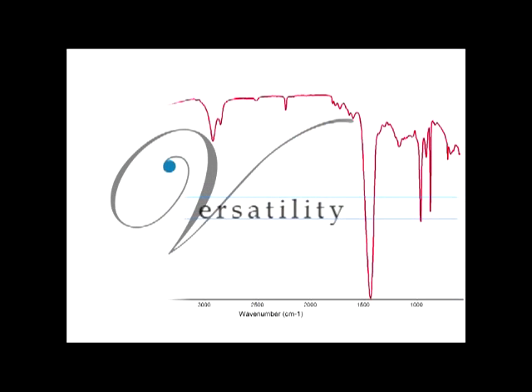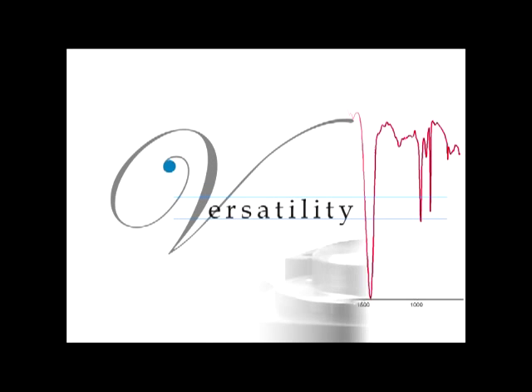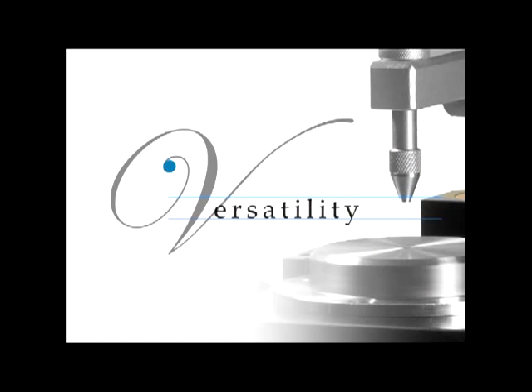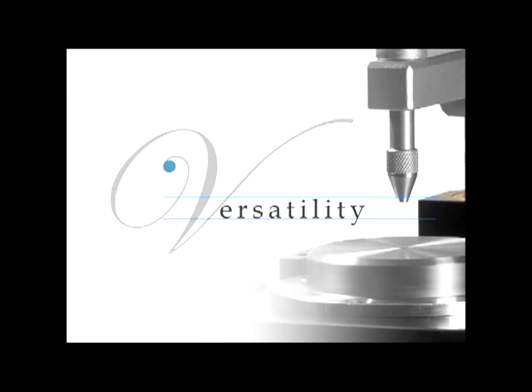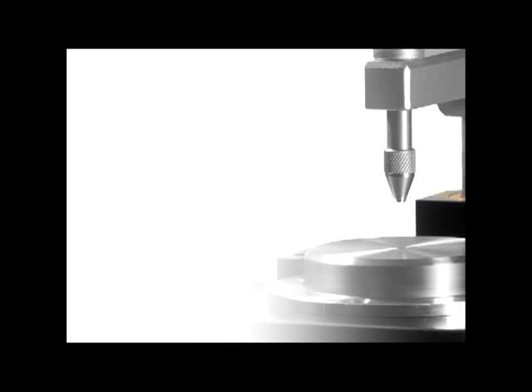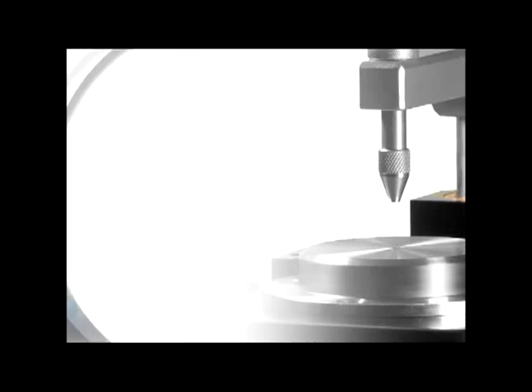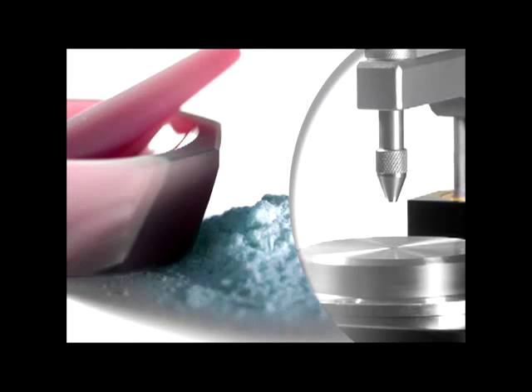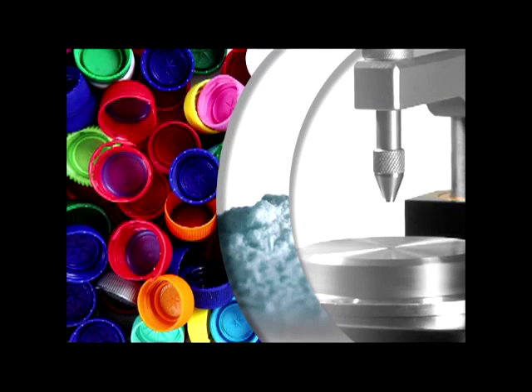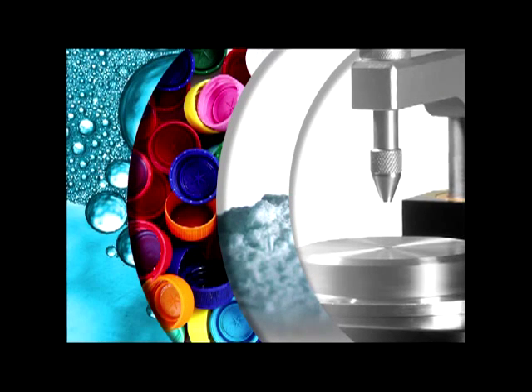The MIRacle's versatility also contributes to its success as the all-purpose ATR for sampling powders, polymers, liquids, and more.